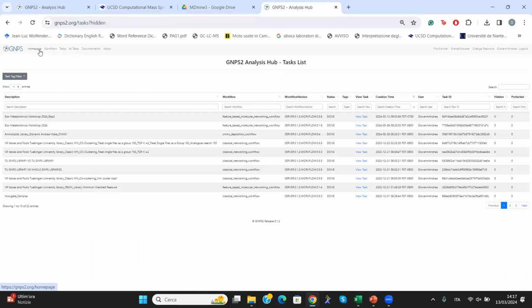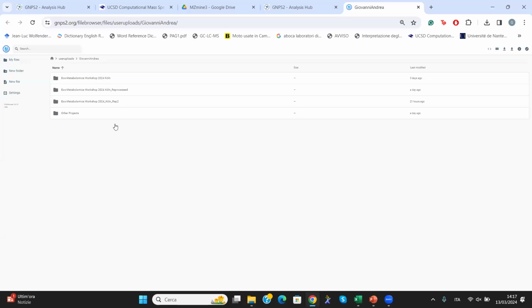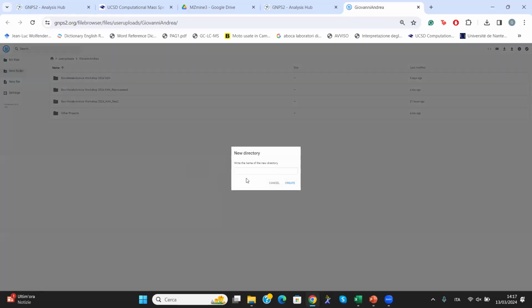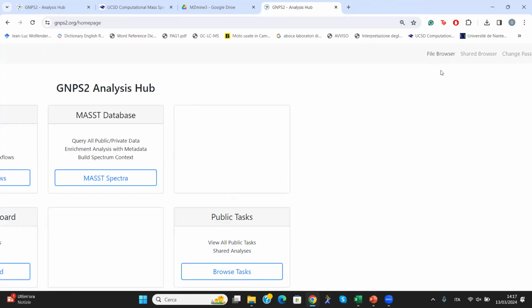Okay, I'm creating a new folder. Click on file browser. Sorry. Here we are. Is everyone in the file browser?